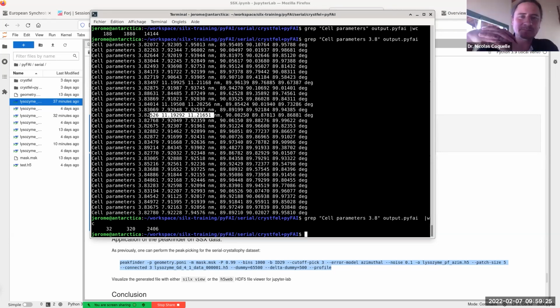And actually, one more suggestion: what you have shown with these found peaks is a very good start for online indexing. Tom and Alexandra Tolstikova recently made several successful attempts to do online indexing. They were indexing crystals during measurements, both at PETRA III and at XFEL. And you already did half of the job, because CrystFEL can accept over ZMQ exactly what you found.